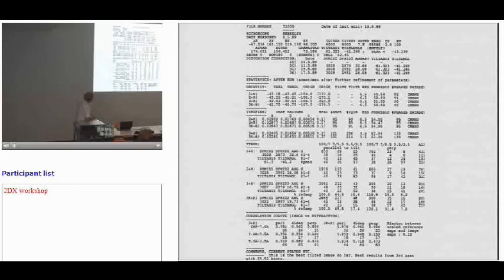And this number H, that's the height in the middle of that 9x9 box. You can see when we started, near the tilt axis, we had a height of 25, still way above the noise, but 8, which is barely above the noise, perpendicular to the tilt axis.